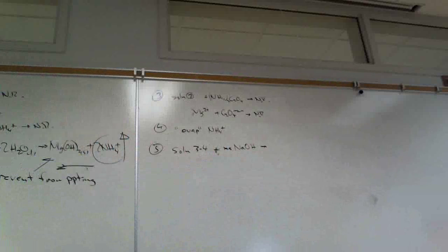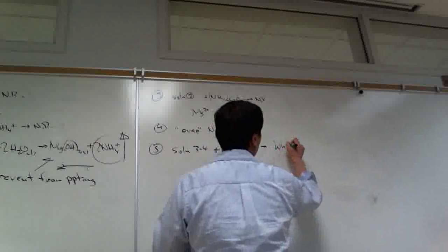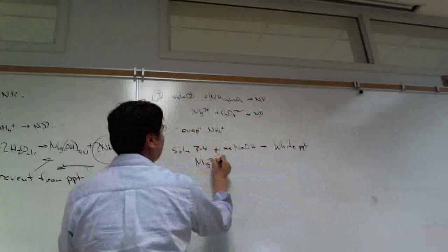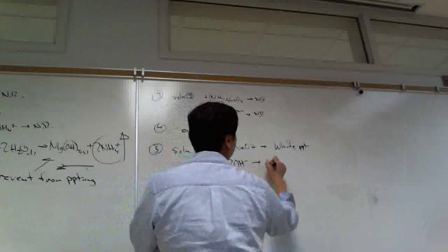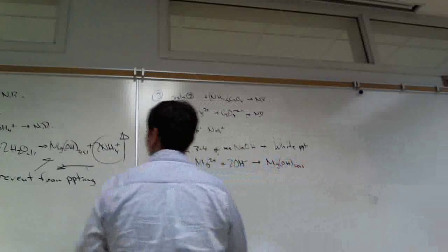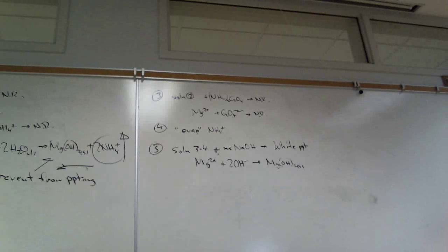A white precipitate. Good. Following along. So white precipitate. And so the reaction here is Mg2+. Now we'll react with a hydroxide, form magnesium hydroxide, an insoluble precipitate, which should have formed over here but didn't because we're controlling it. To this white precipitate, we're adding ammonia now.